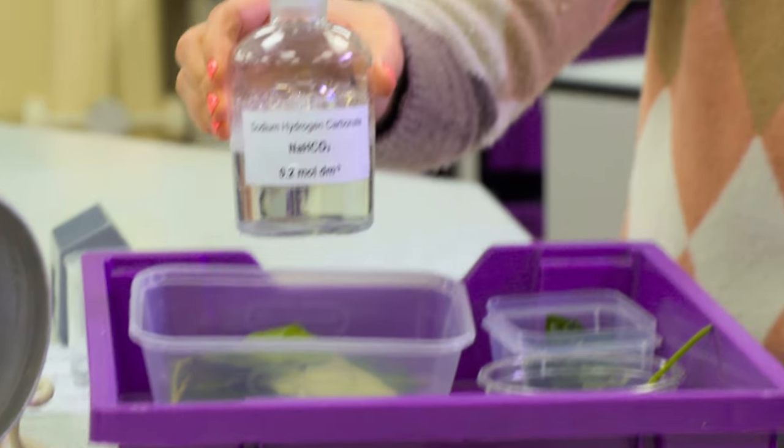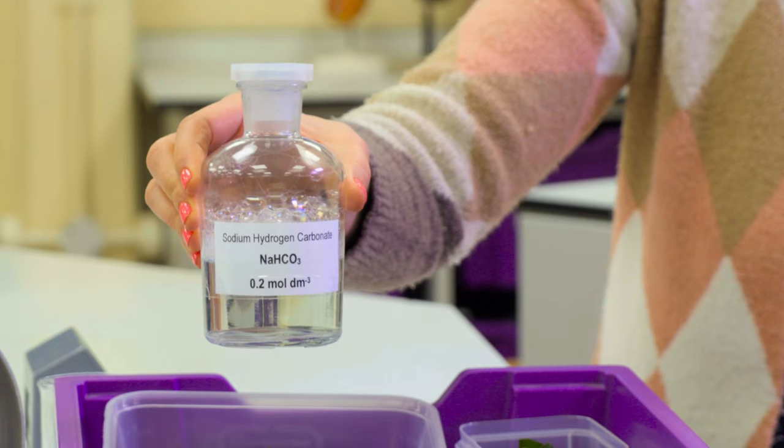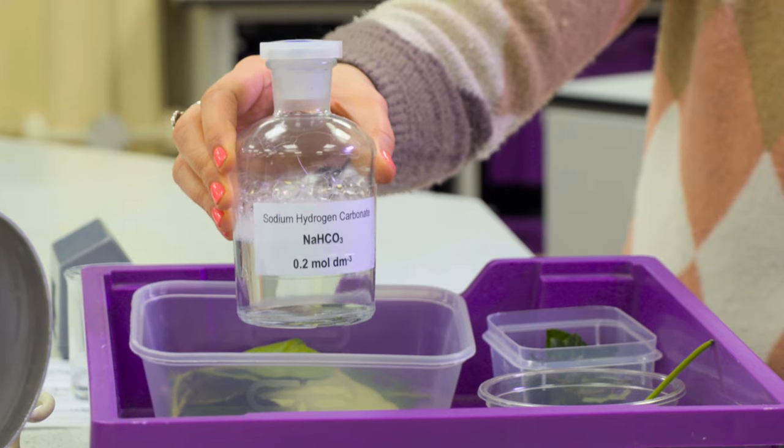You need your sodium hydrogen carbonate solution and you just make this up using bicarb. This is a 0.2 molar sodium hydrogen carbonate solution. To make it, you need 84.01 grams of sodium hydrogen carbonate powder and put that into one litre of water. You get your one mole solution, then take 200 mils of that and 800 mils of water, diluting down a fifth to get your 0.2 molar. Once you've made up a litre, add about four or five drops of detergent to the solution — it just stops the leaf disc from sticking.